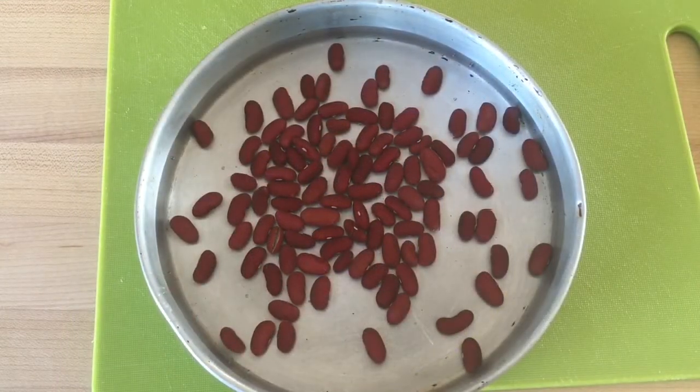I've added water to this container and I'm going to let these beans soak for two to three minutes before I start looking at them really closely. Overall you want to soak these beans for no more than five minutes. Within that five-minute period you will see all the cracks that show up.